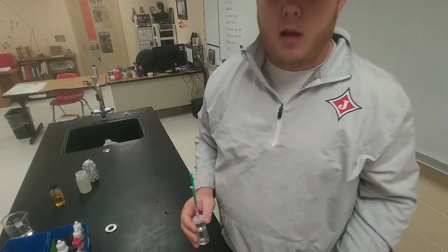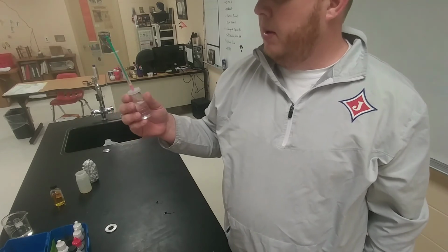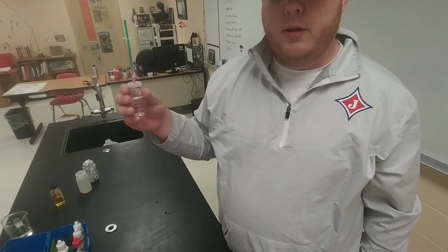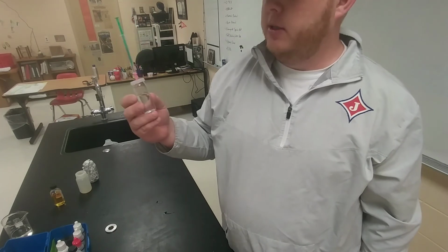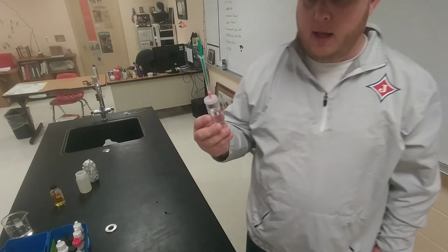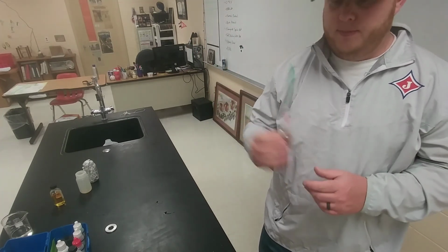So like I said, it's lower. It's not a whole lot lower. It's not as low as I actually expected it to be, but it is. It's 6.2. Before, I'm pretty sure it was 6.8. So now you can subtract the two and get your biochemical oxygen demand, and you can read your Q curve to get the Q value, and you're done with the lab. So there you go.